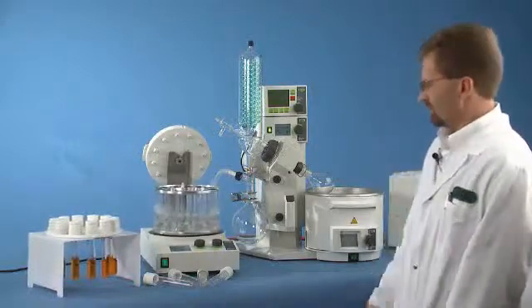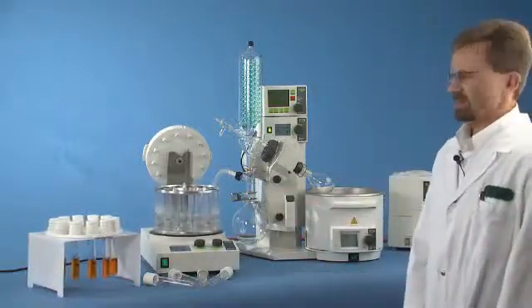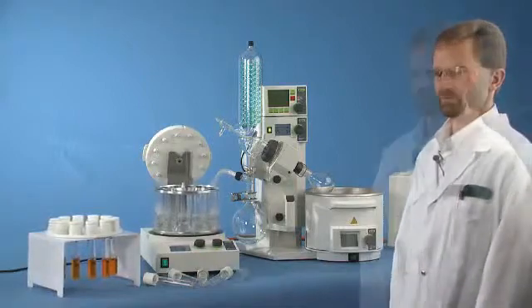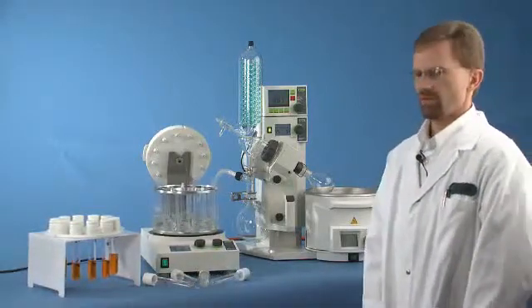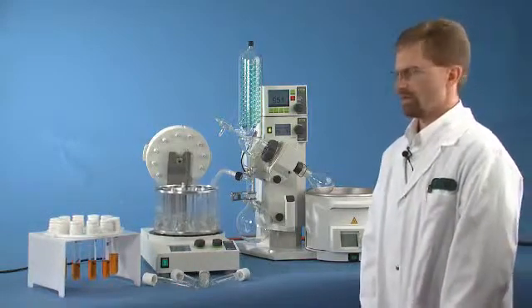The new Bukey Multivapor is a 12 position parallel evaporator. The key features of the Multivapor compared to other parallel evaporators are several.